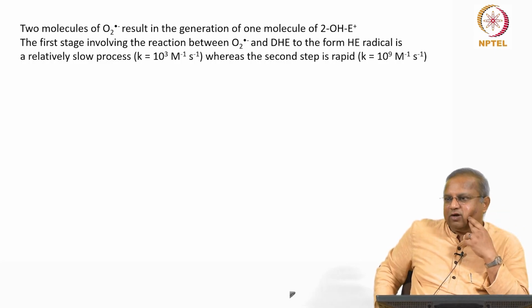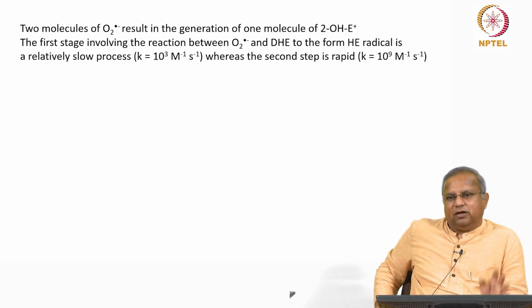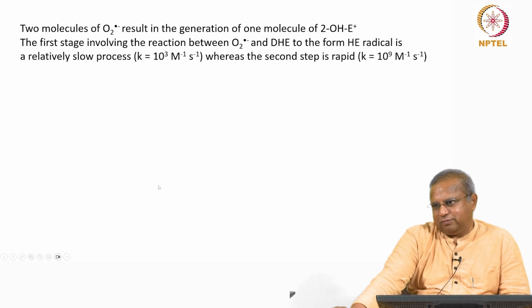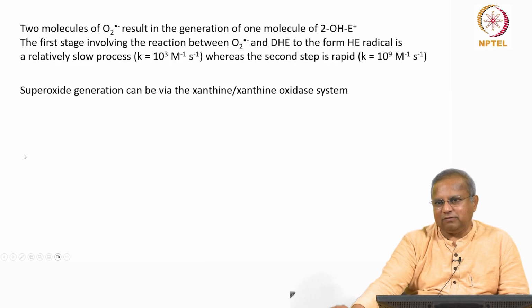So when Ranjani joined, and this was 2009, she graduated in 2014 or 2015, she wanted another method. I didn't care, as long as it is an acceptable method in the literature. I said follow it. So she somehow didn't feel comfortable with KO2. No reason, but it works well. She said, "Can I do this?" I said, "Yeah, as long as it is an established method in the literature, I have no problem. It works." So I'm just going to discuss that.